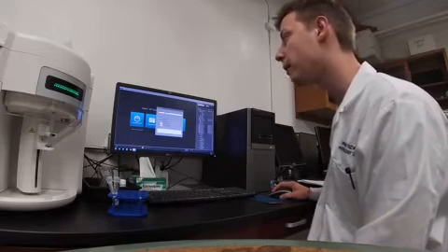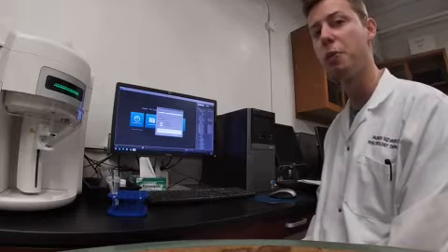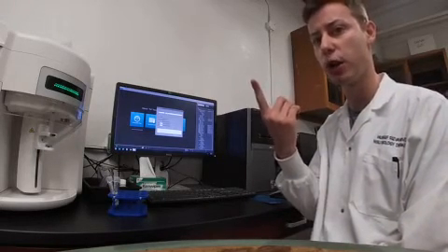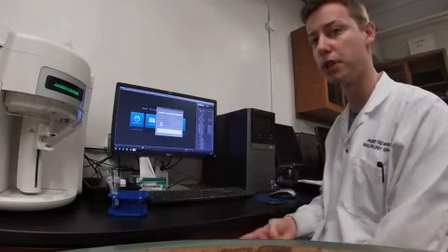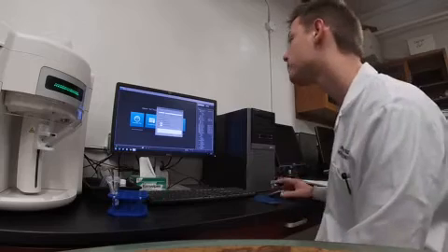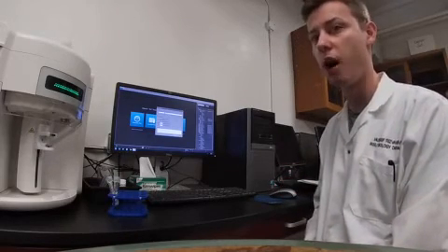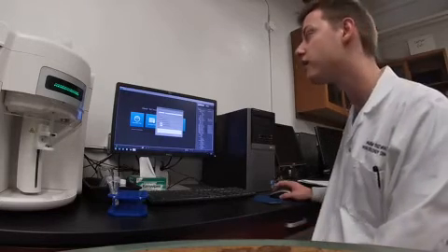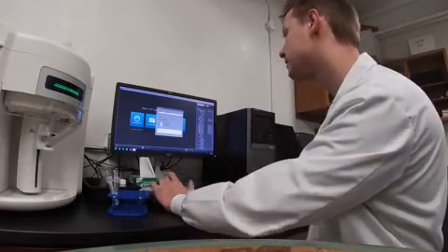It's going to ask you how many groups you have and how many samples you'll have for each group. Group is the number of treatments you have. So for example, we have a non-treated control group, we have a positive control group, we have our control groups that we're experimenting, so on and so forth. Samples is then how many times you're going to repeat this. So if you recall in class, we seeded triplicate repeats of each well, so you'll have 4 groups, and then you'll have 3 repeats of each group.